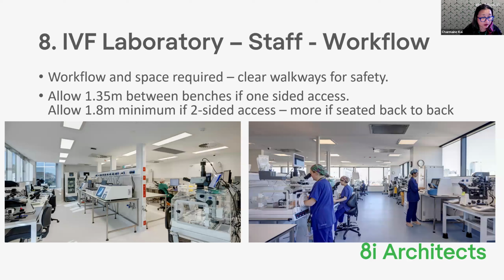And all of our building code compliances mean that, depending on the type of building and the number of exits, you're not more than 20 or 40 metres away from an exit. So those designated paths are always kept clear. There's no equipment in the way. There can't be any furniture in the way. It's a clear path for safety access. And in a lab, that's really important, particularly in disaster management situations where people are moving around quickly.